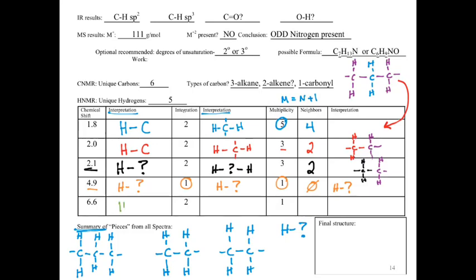We're looking at a hydrogen again bound to a question mark with 2, so it's a hydrogen, 2 hydrogens to that question mark. Again, our multiplicity tells us 0 neighbors. And we'd again put in that question mark. I can do one slight tweak from this. If you go back to the HNMR spectrum, what you'll notice is that that signal was very broad.